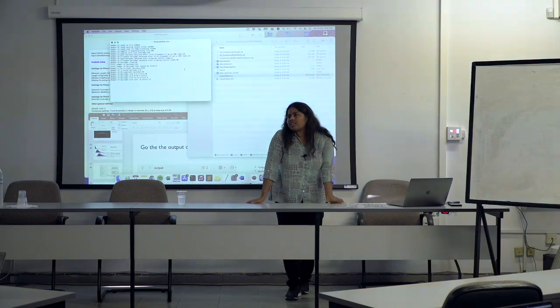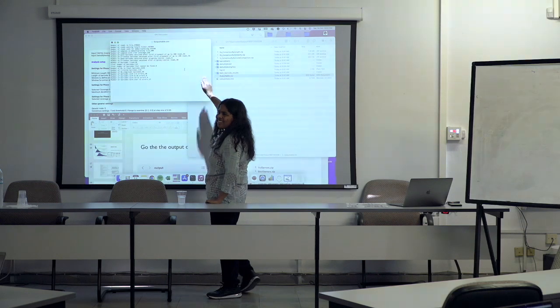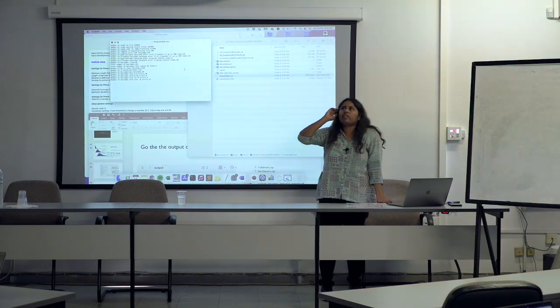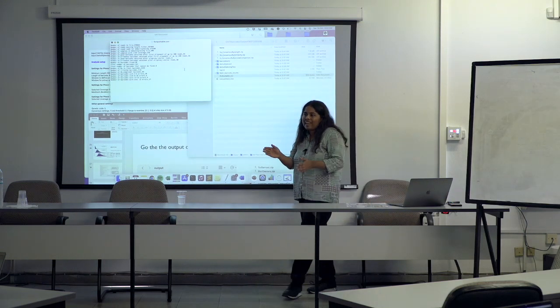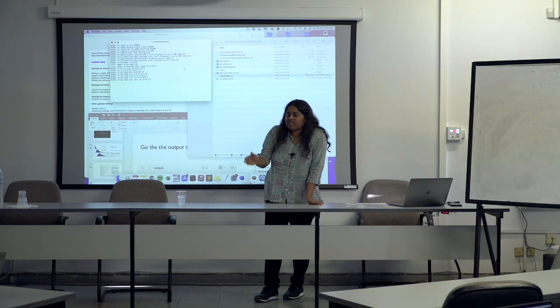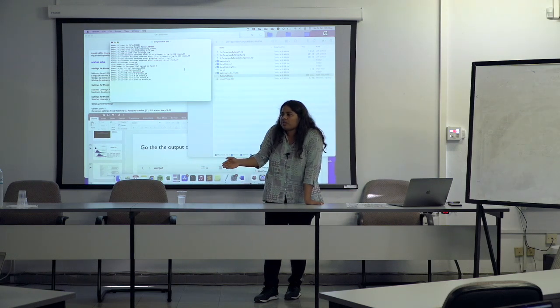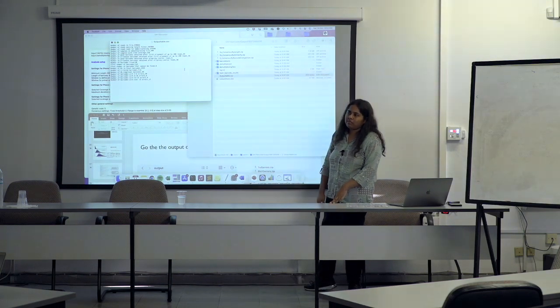Of course, these are absolute criteria applied to slightly random processes. So the challenge is when you have a criterion like 1% N, and that's 6 bases versus 7 bases of ambiguity codes introduced. You can accept your 7 bases if you really want, but that's the outcome.